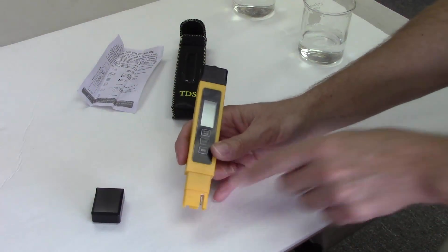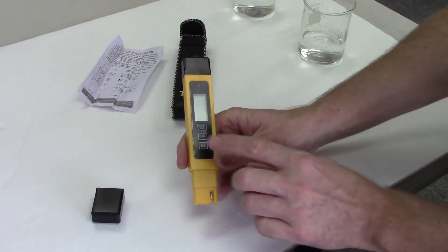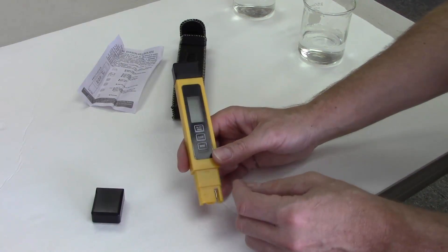You only need to stick the part of the probe at the bottom in the water. You've got three buttons: on/off, clear, and mode.